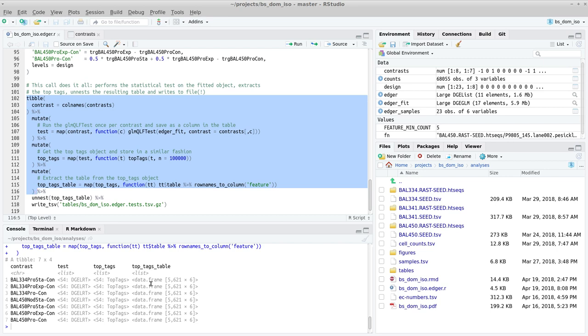Now, we're very close to what we actually want to achieve with this. What we want to do next is extract all the data from each of these data frames into those 6 columns and these rows here, and keep this one but expand it.